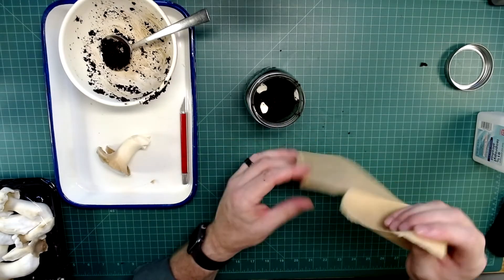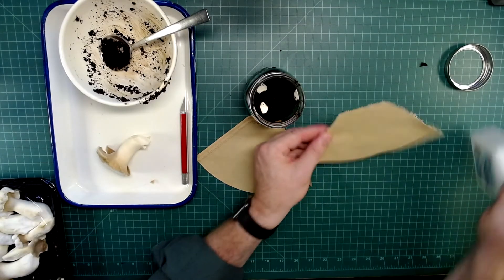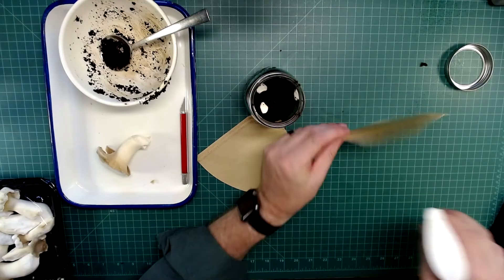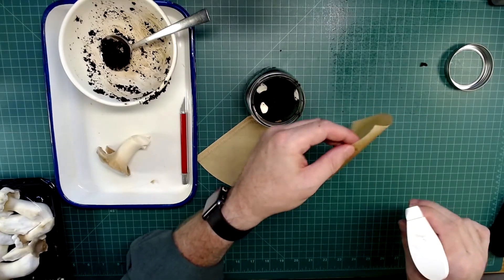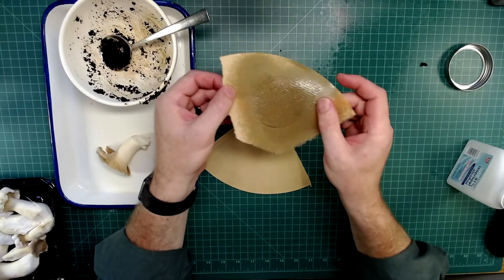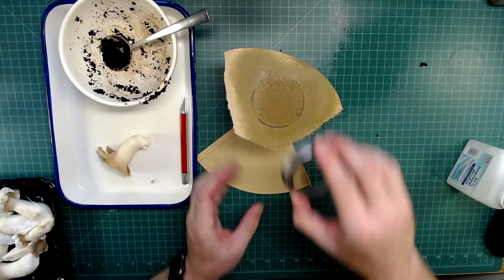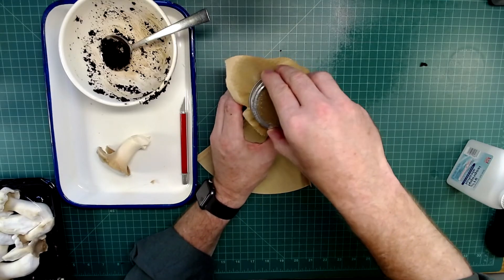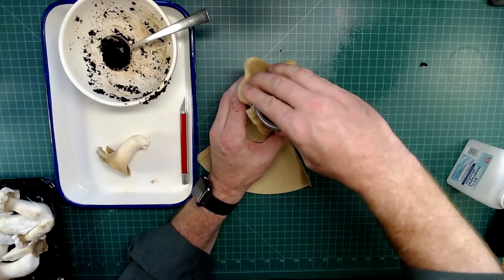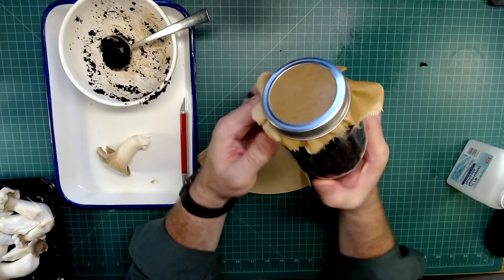I'm just ripping the coffee filter in half and spraying it with alcohol to make sure anything on it is killed. Then I'm going to lay this over the top and seal it with the canning lid. If you don't have a canning lid, you can use a rubber band, or I've also used saran wrap with holes poked in it, which works quite well.